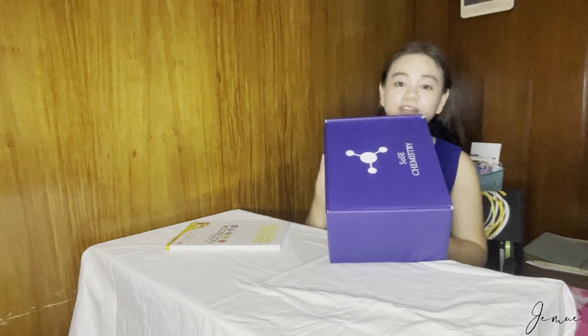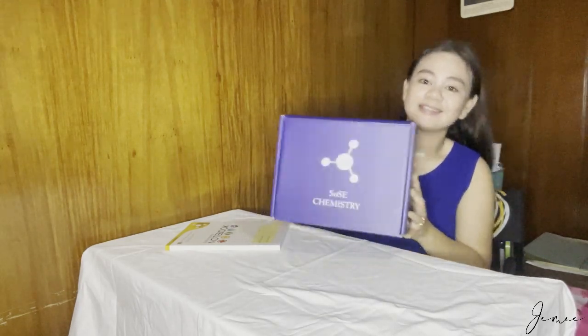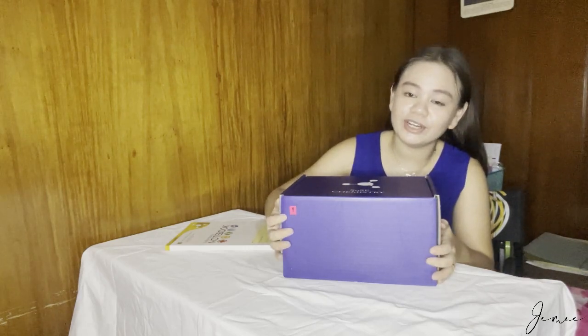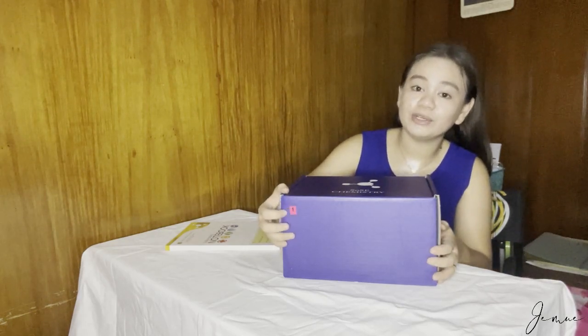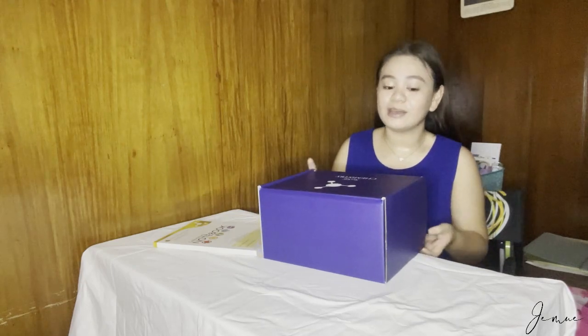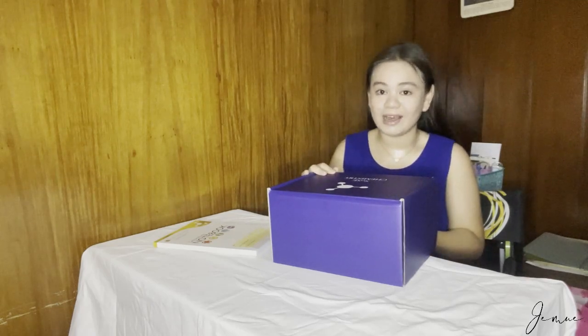Guys, ganito yung ketsura niya. Super laki ng box — hindi ko siya in-expect na ganito siya kalaki. Before you open it, may nakalagay dito na number kung anong number ng lab kit mo, kasi it depends kung ano yung tinitake up mo na chemistry — if organic chemistry or basic chemistry. Mine is number one kasi first semester pa lang.